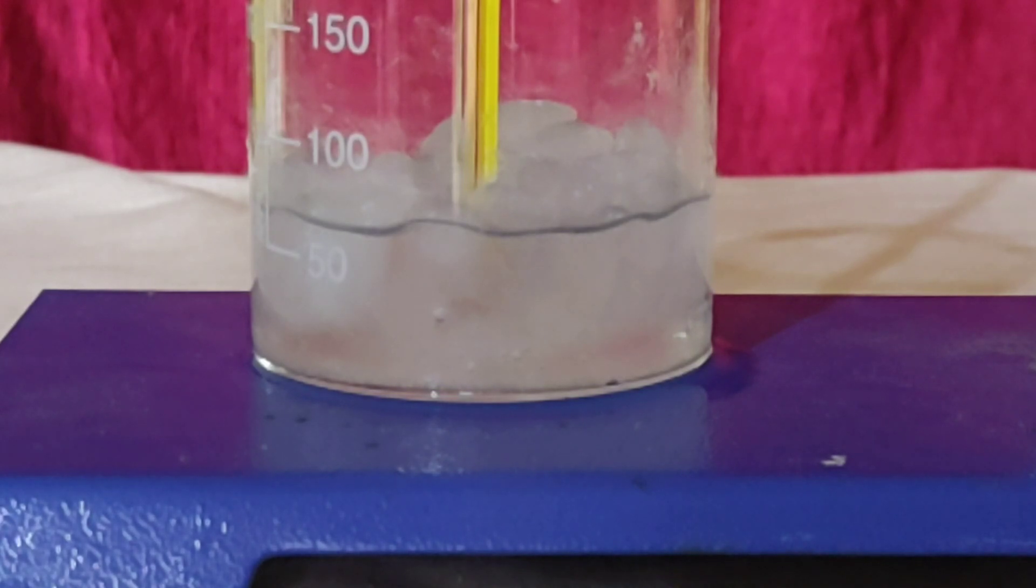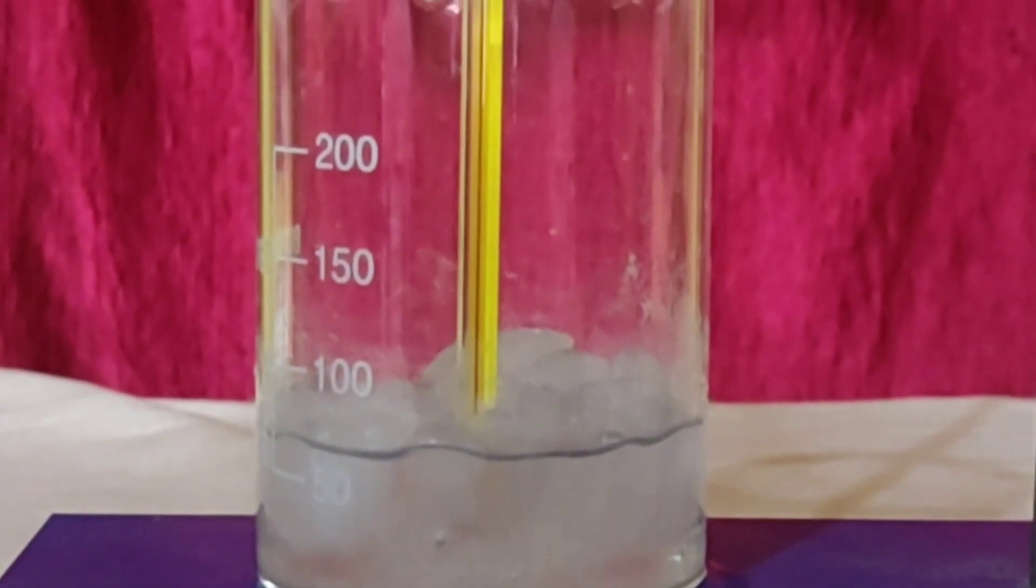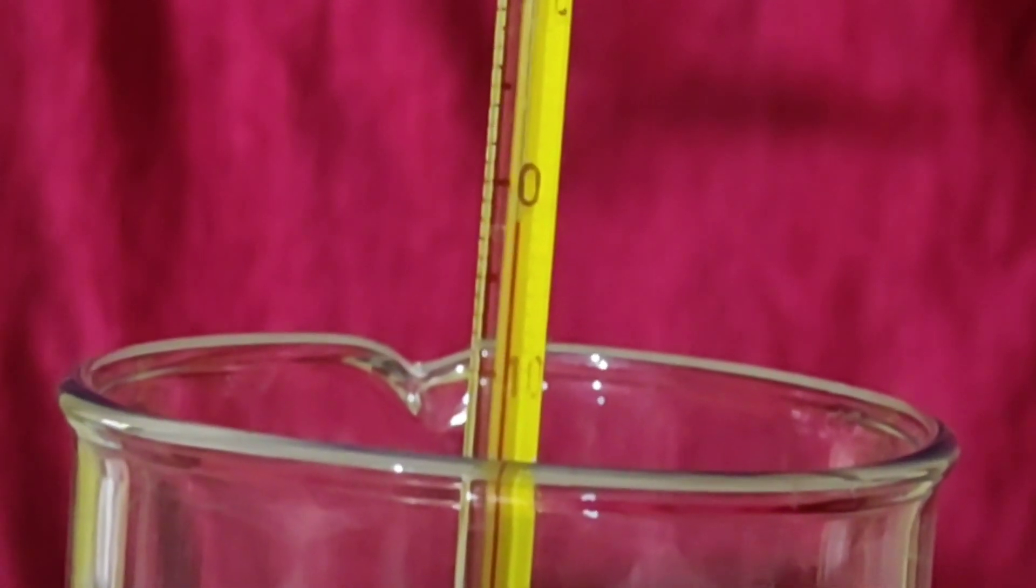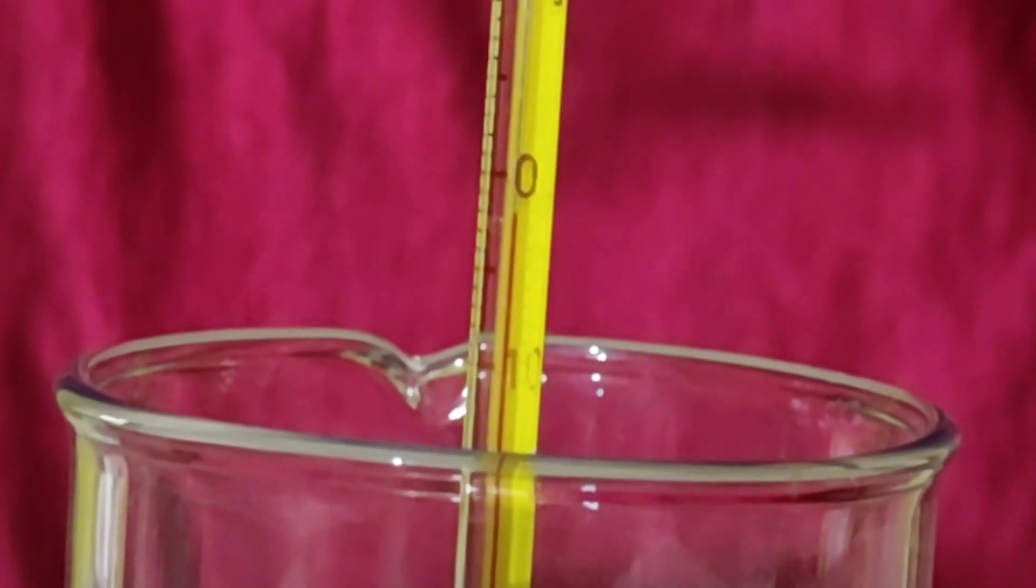Let the bulb of the thermometer remain in the mixture of ice and water for some more time, and keep recording the temperature. Do you observe any further change in temperature? No. So, what have you learnt from this experiment? The melting point of ice remains constant during the melting of ice.